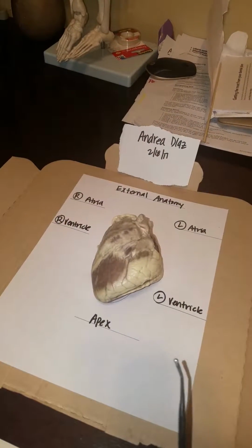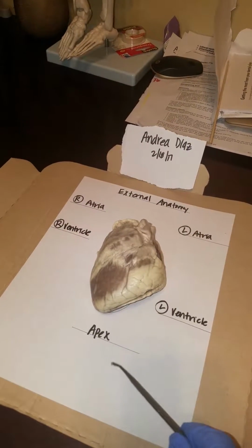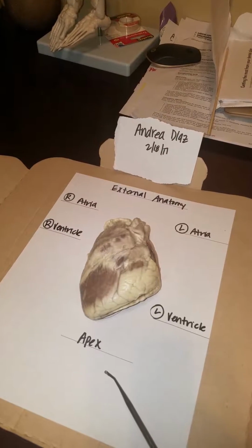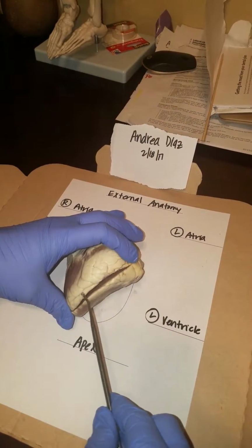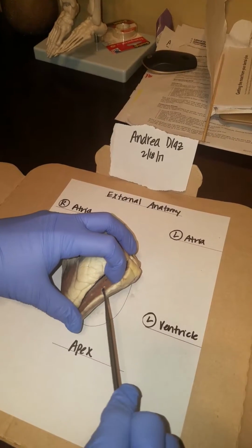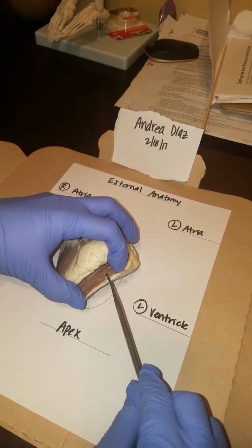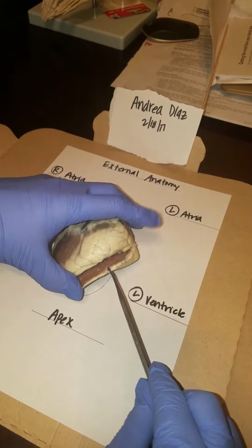My name is Andrea Diaz and I'll be going over the external anatomy of the sheep heart. First, the epicardium is the middle layer in between the parietal and myocardium. So that would be this layer here. If you look inside, this denser red tissue is the myocardium. So the middle layer epicardium would be the layer right before that.